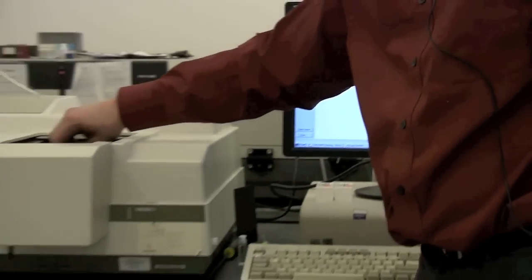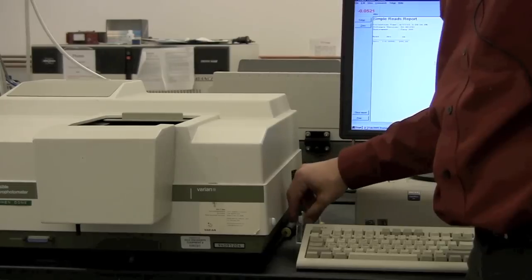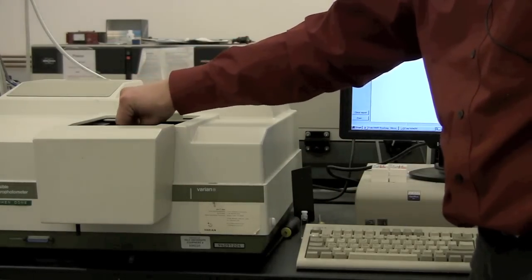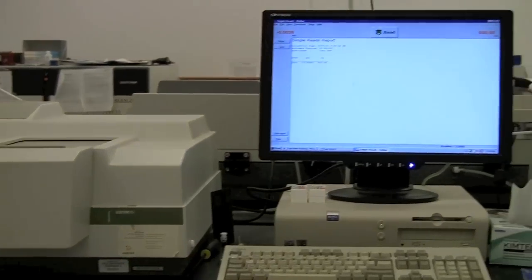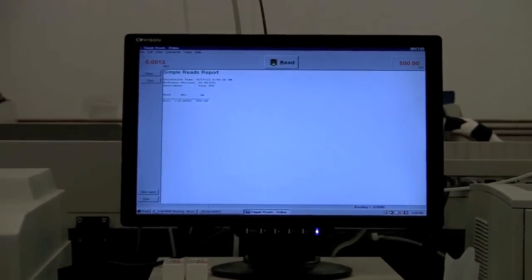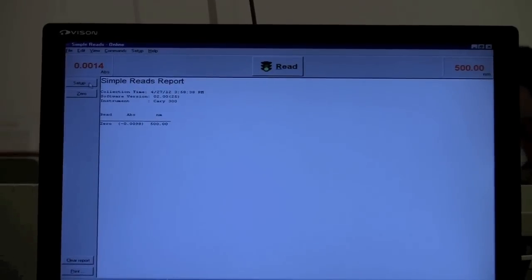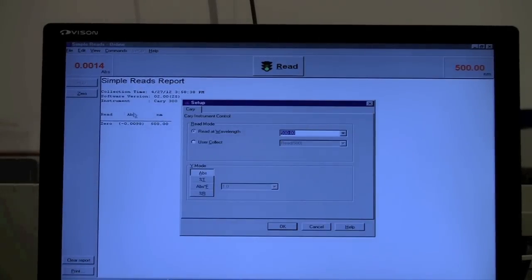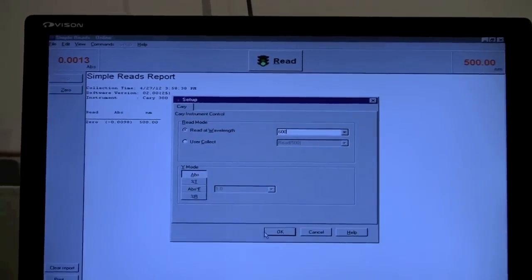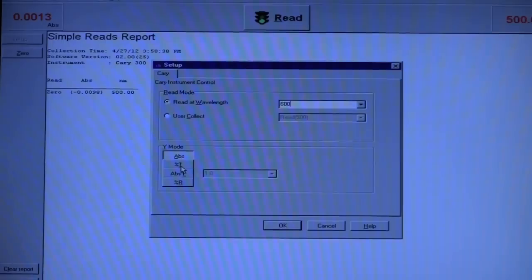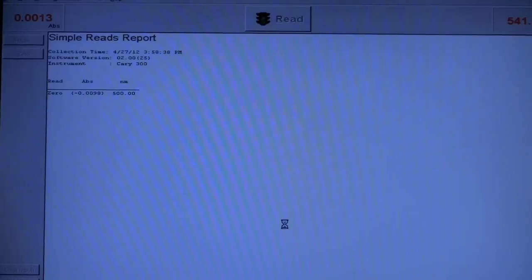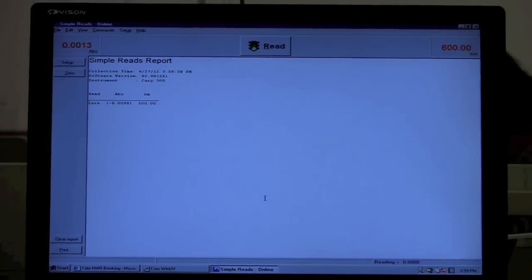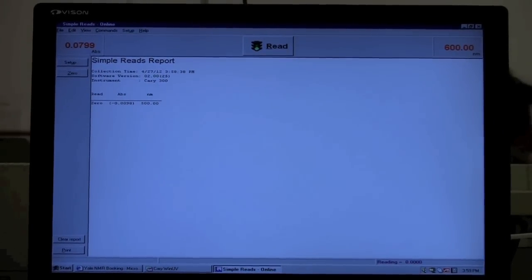And then you can put in your sample. And you can measure the absorbance at a particular wavelength. If you wanted to measure a different wavelength, you can go to Setup and change the wavelength here. You can change whether it's absorbance or transmission. And measure the absorbance at another wavelength.